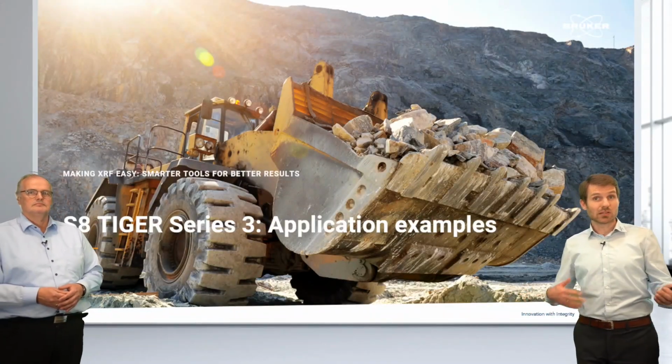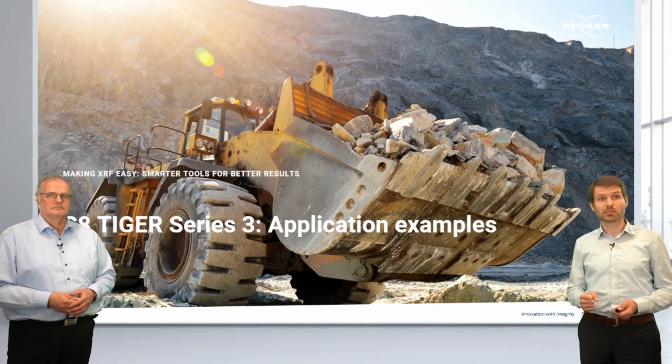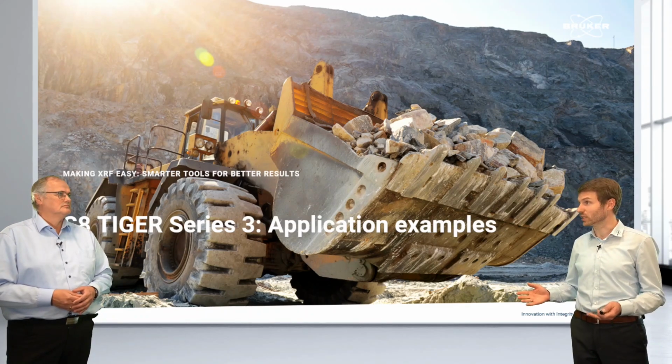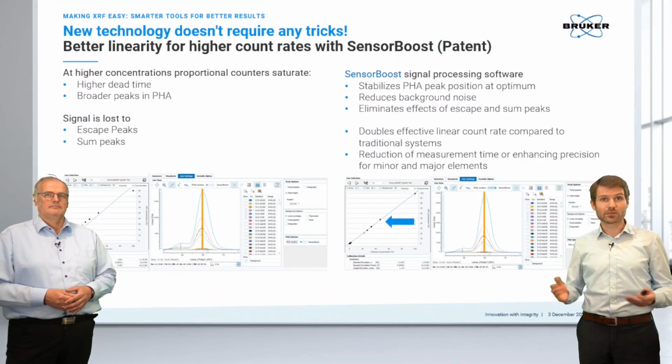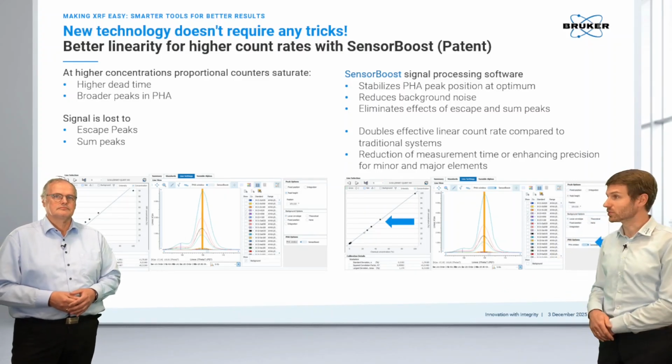With this introduction about the software and our new functionalities, we now want to switch to some use cases, so application examples where we actually apply some of the functionalities to applications. And the first one, Kai, maybe you can talk about is sensor boost.